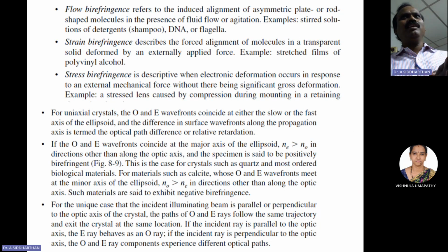A transparent material is loaded. When it is getting strained, we find that birefringence takes place. Physical locations appear in certain colors, a stack of colors. Such a study is also carried out on a 3D model. You want to experiment on how the loading characteristics and how the stresses are distributed.